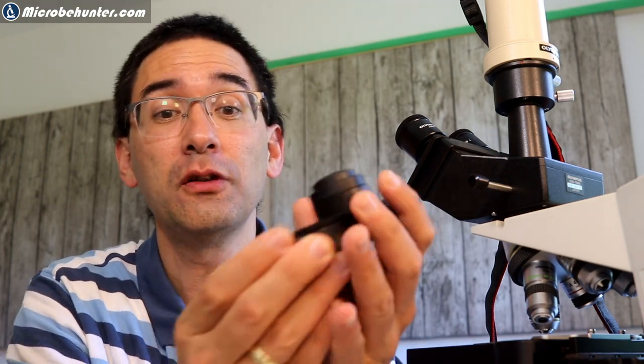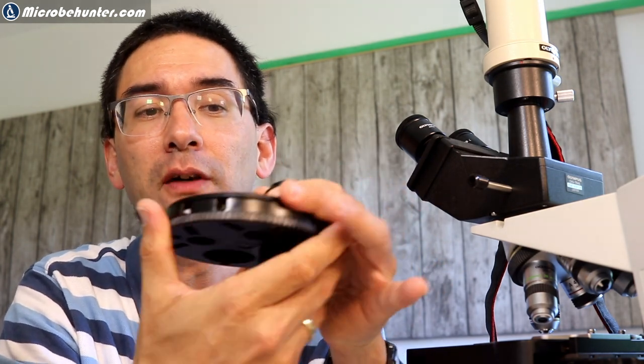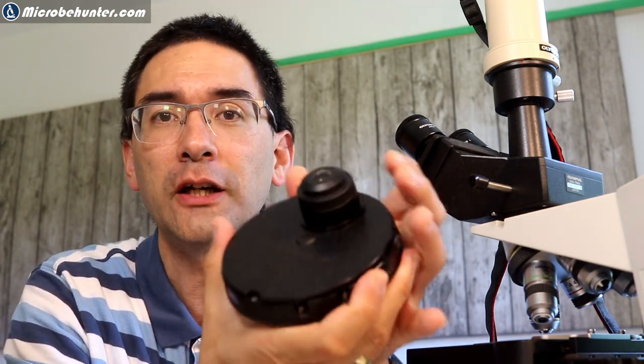All you have to do is you've got to change this to bright field here by rotating. And then you have a regular bright field. There is a small loss in image quality, however, because of the so-called phase ring, which you can see inside the objective. But that, I would say, is the topic of a separate video. So I'm going to now continue and I'm going to show you some more pictures under phase contrast.